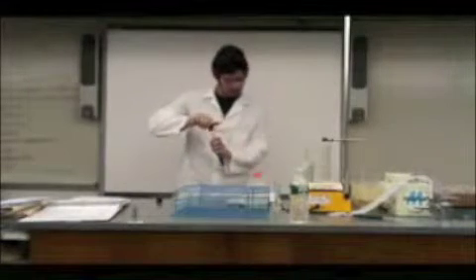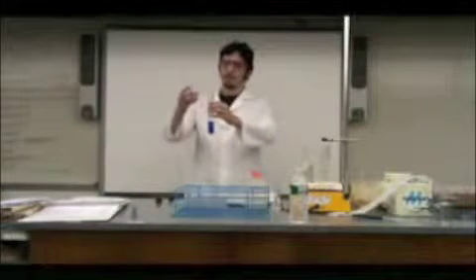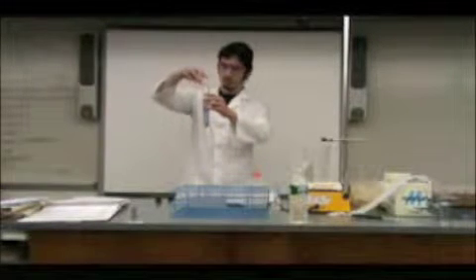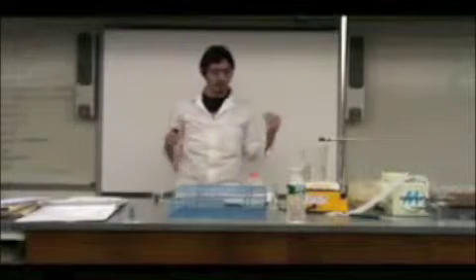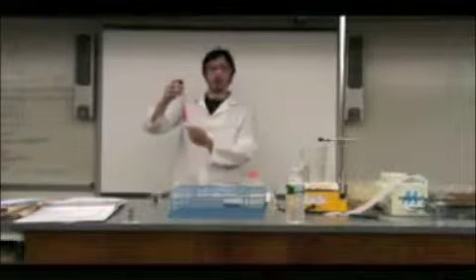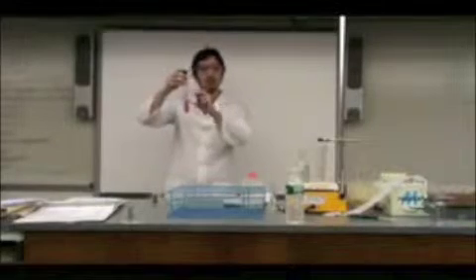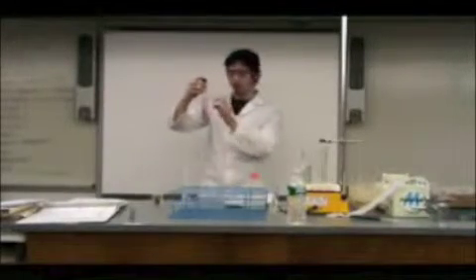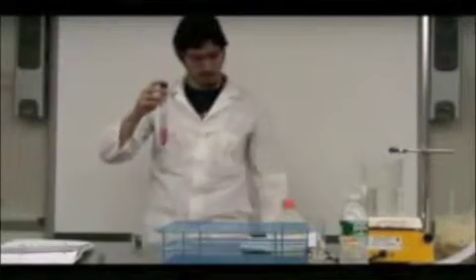Now I'm going to add water, and we're going to see that a color change occurs. When the water hits it, the cobalt immediately reacts and dissolves with the water and goes to its ion state, which is a pink color. As you can see, it's separating because the water goes to the bottom, the T-butyl forms on the top. There's less water within the T-butyl alcohol solution, so it's a very faint pink, mostly clear at the bottom. There's more water for the cobalt to react with, so it's a much darker pink.